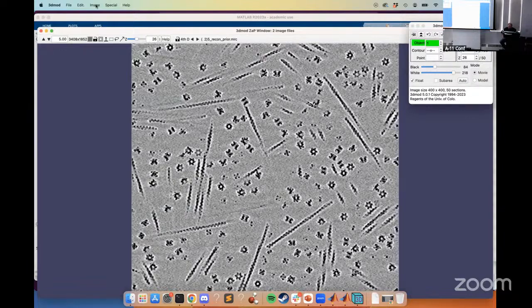So if you want to extract subsets and get all of that angular information, Amira actually has the best tool for that right now. Is there anything else that we could cover or I could show you? I'm not in a hurry to get out of here.